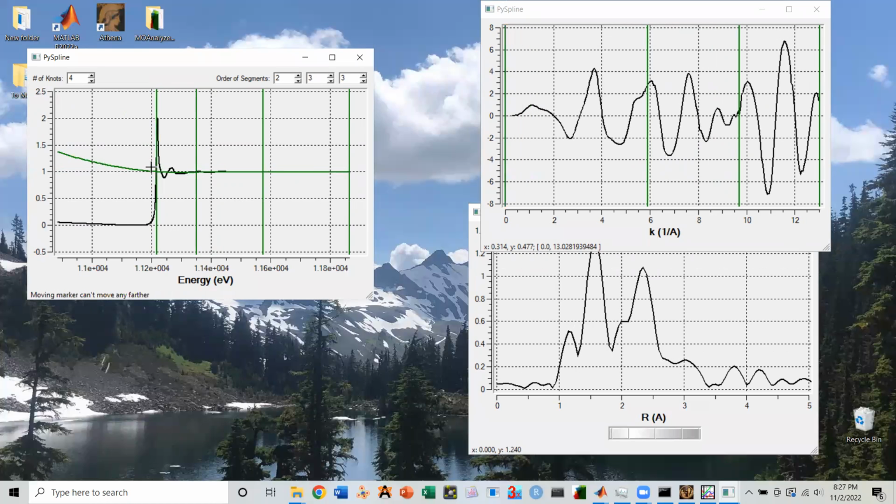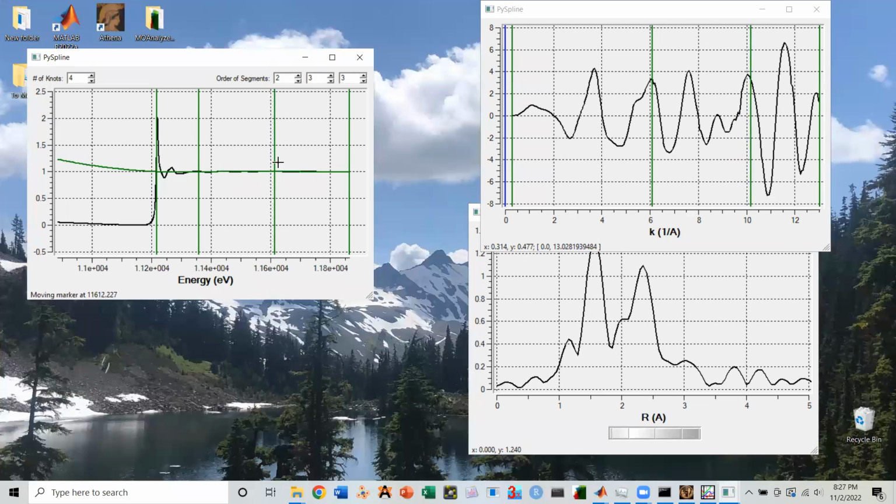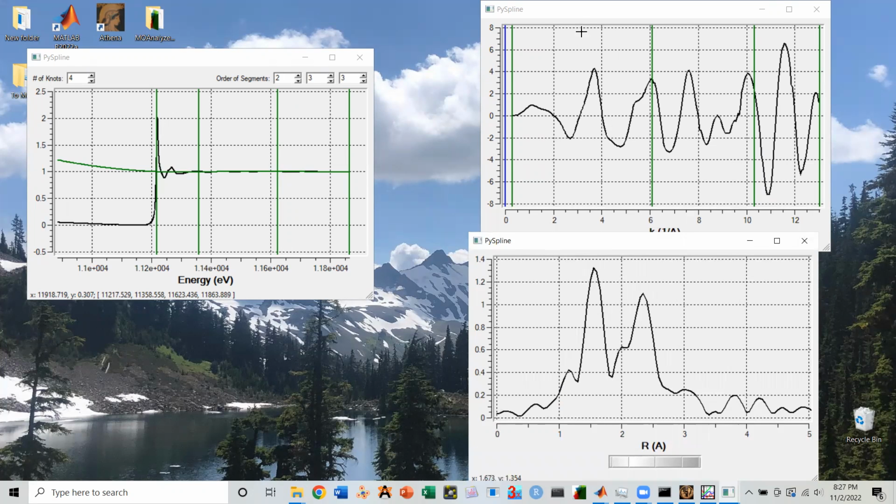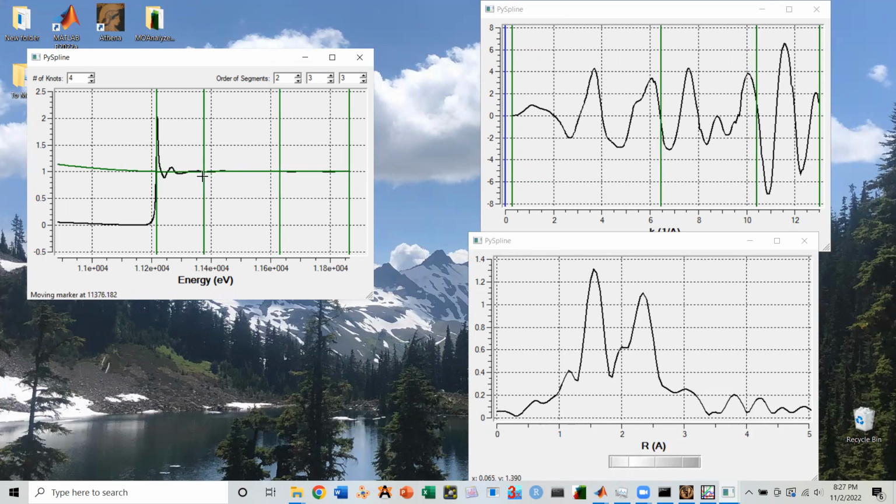So to begin, actually I already kind of like this. So this is the game then. You kind of want to play around with your different levers, trying to minimize. In this case, I'm trying to minimize this feature because I know this is iridium. Iridium's not going to have something at like 1.4 or 1.6 angstroms, probably not at the oxidation state that this is at anyway. There's iridium 3, or it should be iridium 3. So you can already tell I'm already pretty close.